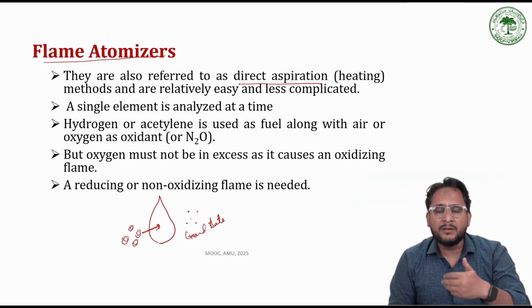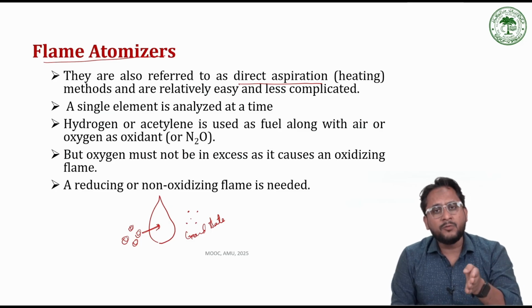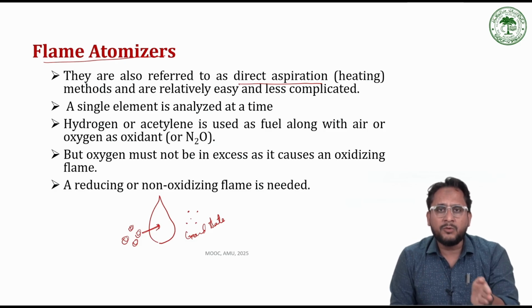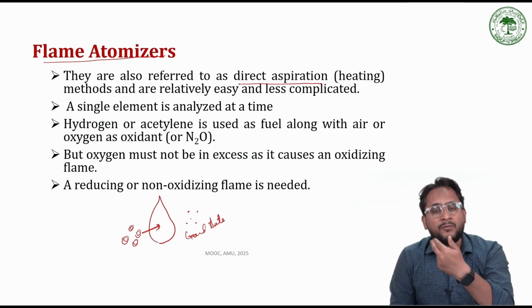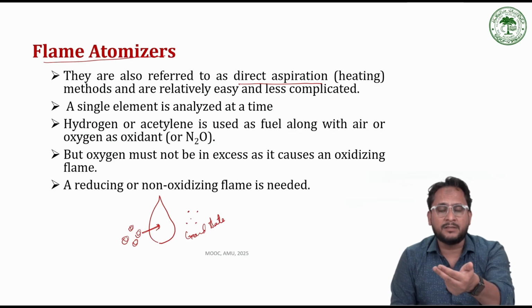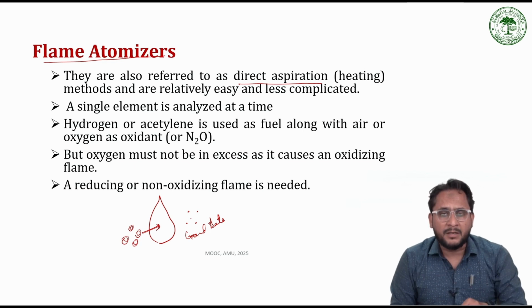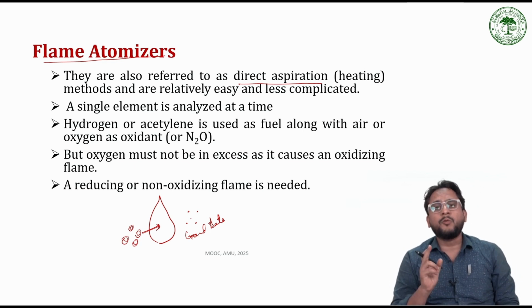They provide even higher energy, because in emission spectroscopy we first convert the molecules into individual atoms, then we convert those atoms from ground state to excited state, so that they start emitting light, forming an emission spectrum.